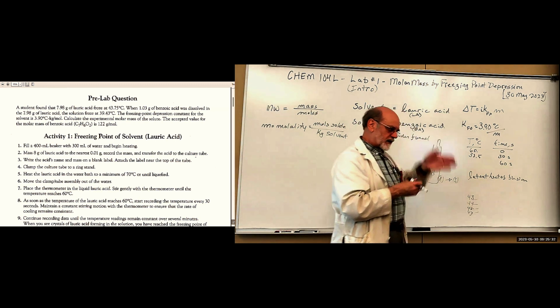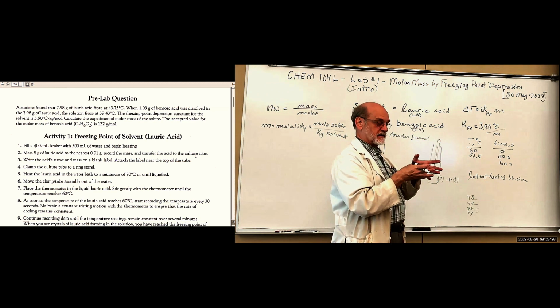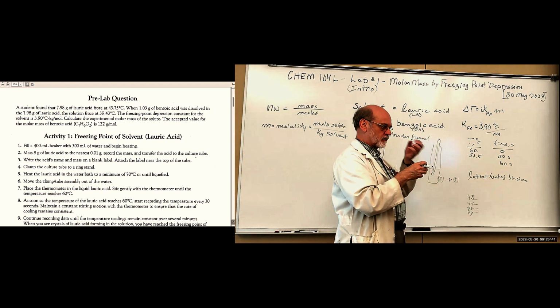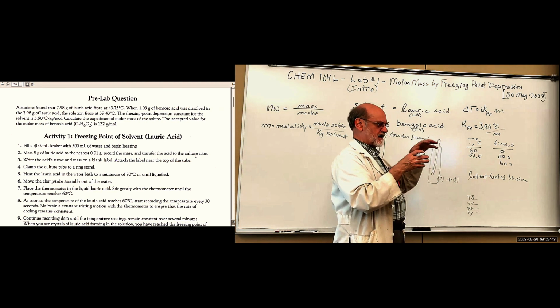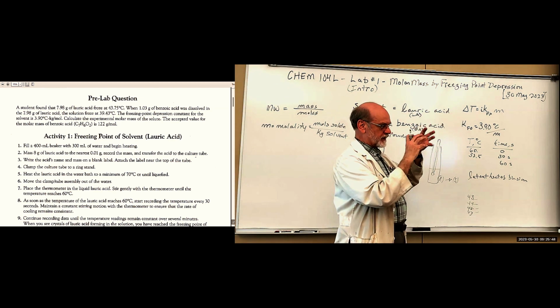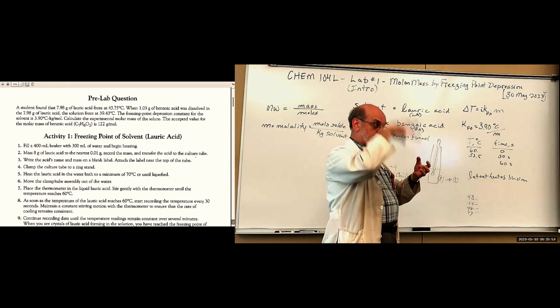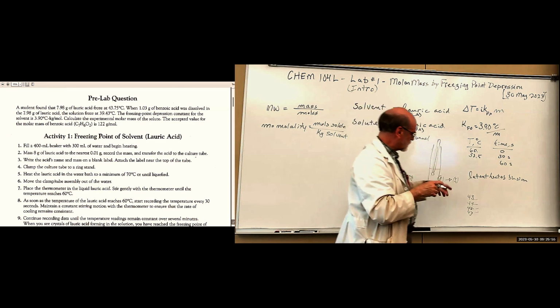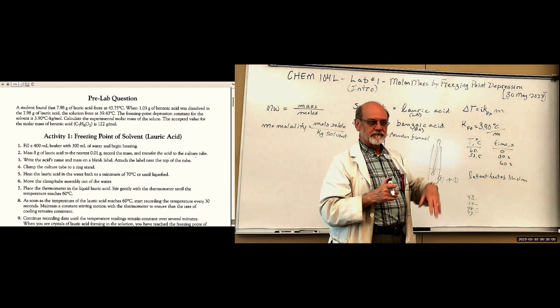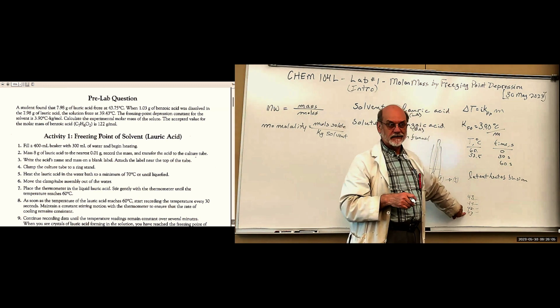But when it goes from a liquid to a solid, it gives up more heat than you would expect. And the temperature jumps up as it releases that extra energy. See, these liquid molecules are in there moving around, maybe vibrating, and then they get fixed into solid. And when they do that, they're at lower energy. So they got to give up that heat. And sometimes the heat manifests itself as an increase in temperature, and then it'll settle back down. So we don't want this latent heat temperature. We want the temperature when it's actually solid.